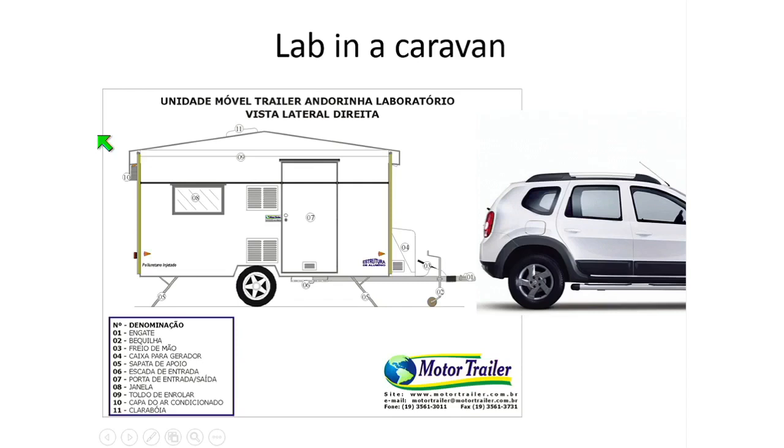And the new thing is Lab in a Caravan. It's a fully kitted out CL3 lab in a caravan, in a trailer, which can be towed by a jeep, with the sequencers, the RT-PCR, qPCR, all the stuff you need to do sequencing on the road. And so hopefully this is something we can continue to miniaturize, and it's something you can imagine in your general practitioner's clinic or in a hospital very soon.